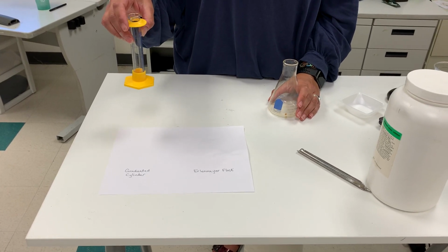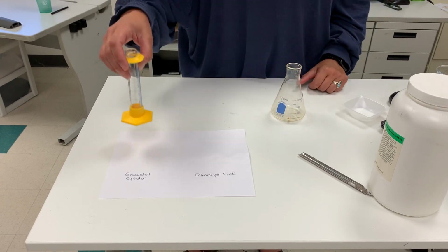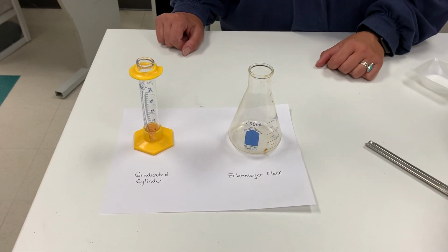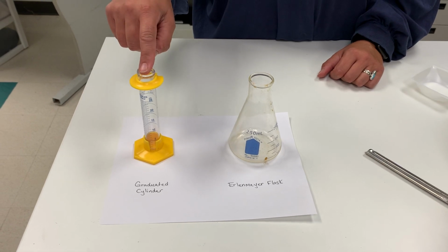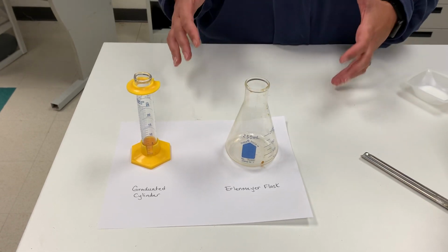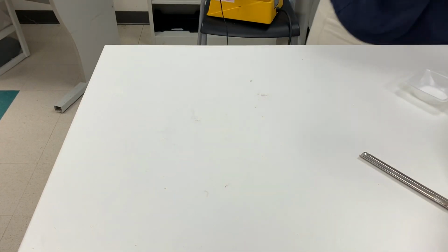We're here for Honors Chem at Skyview, and we saw two measuring devices that were containers on our video. This was called a measuring cylinder. It's actually called a graduated cylinder. This was called a conical flask, and it's actually called an Erlenmeyer flask, for no other reason than we live in the United States. So you can make those changes.